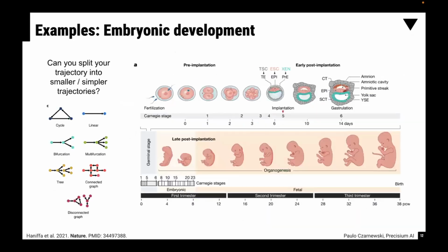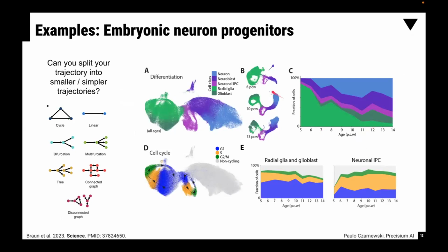Yes. I think that comes back also in this example that you have. That is kind of solved when you do the integration of your data set, right? These cells here, for example, don't have mature neurons at this stage, but in the other stages they do. That's why when you run the trajectory, the space you're running it in, or the clusters you're defining, are always in the integrated space, so you remove these batch effects.